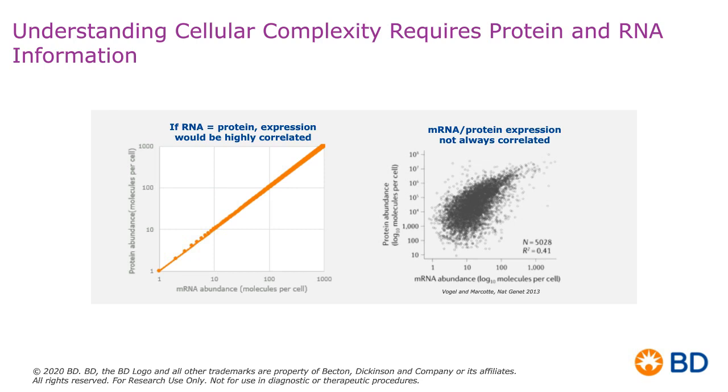And now, of course, I'm a biased cellular immunologist. To me, I think protein equals function. I use flow cytometer because I want to learn about the function of cells because I want to look at proteins. And that's why I look at BD Biosciences as really a protein analysis company. We enable the interrogation of cells for protein expression.